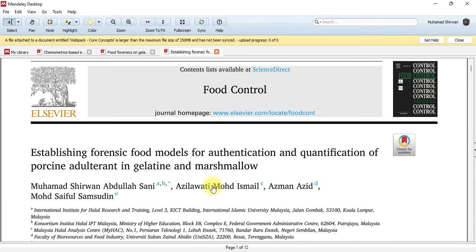Same parameters, same HPLC, same calibration. Calibration curve is still the same. Sample to repeat banyak kali. Memang banyak. This one yang memang paling rajin yang pernah jumpa. I just tolong tuliskan paper je. Okay.